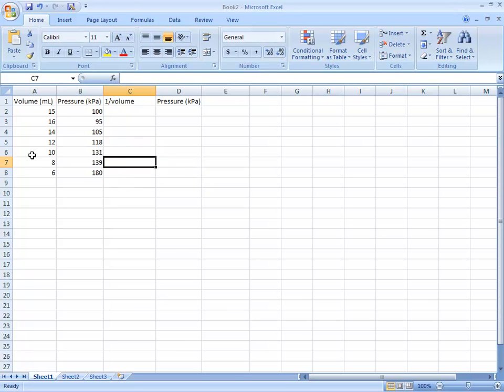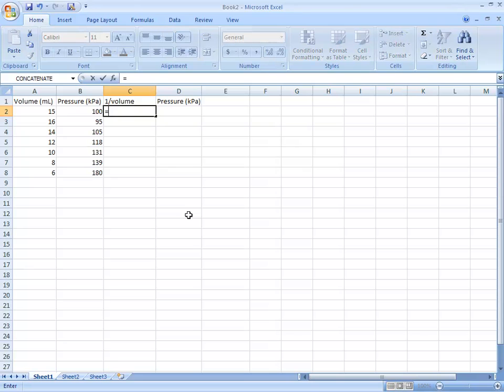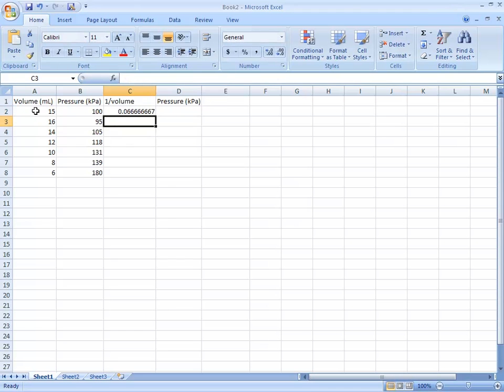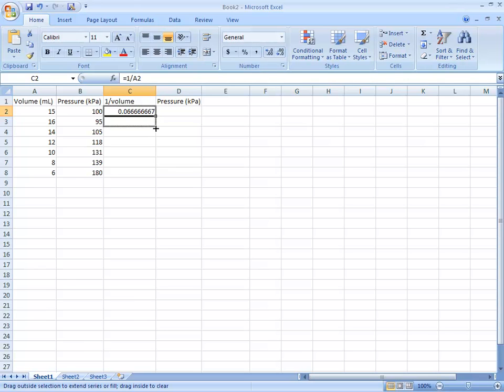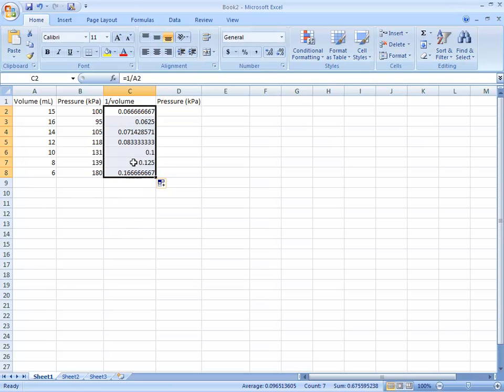Once you have those entered, for the 1 over volume column, press equals, then 1 slash, and select the volume column cell. That calculates the inverse volume for your first data point. Then select the bottom right corner and extend it all the way down to calculate the inverse volume for all the data.